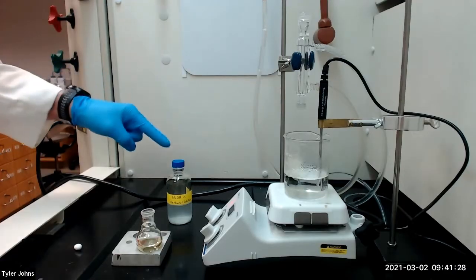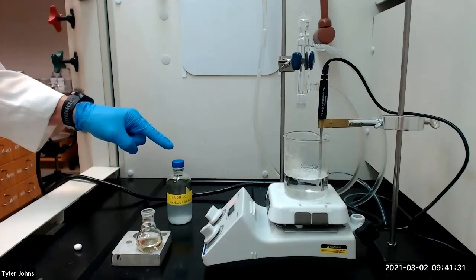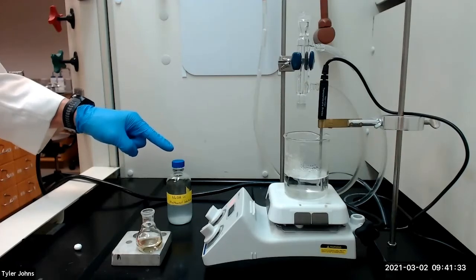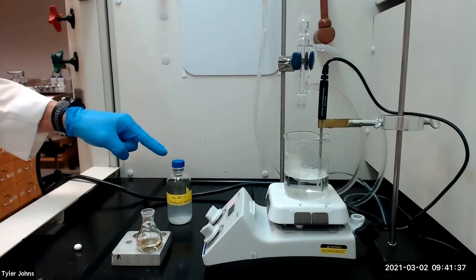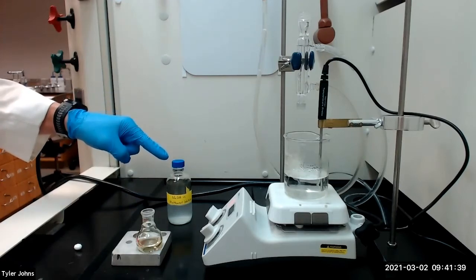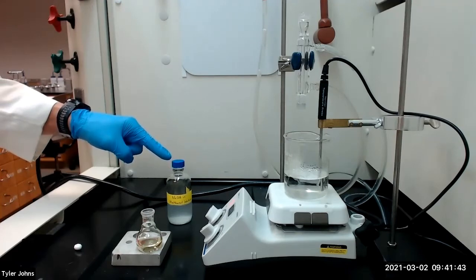We will next add 2.0 milliliters of sodium hydroxide dissolved in methanol solution to the vegetable oil in the round bottom flask. The sodium hydroxide in methanol solution is made by dissolving 0.875 grams of sodium hydroxide in 50 milliliters of pure methanol.